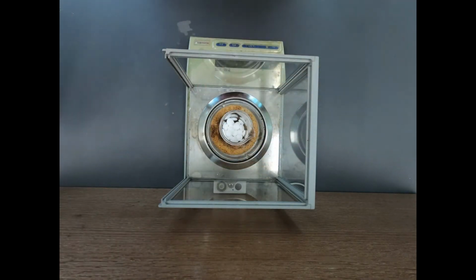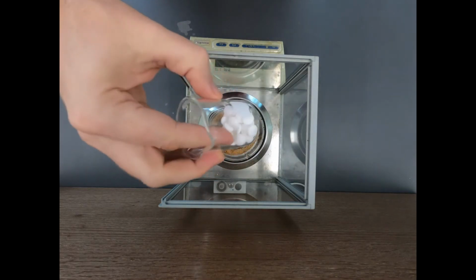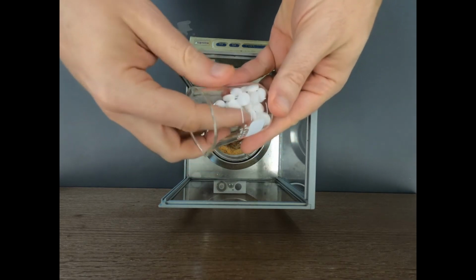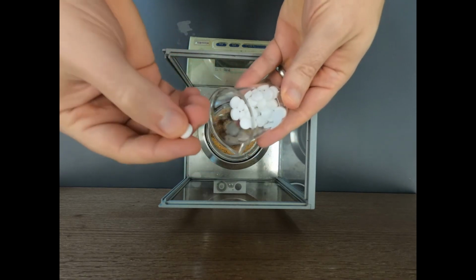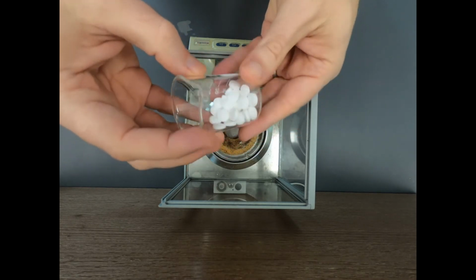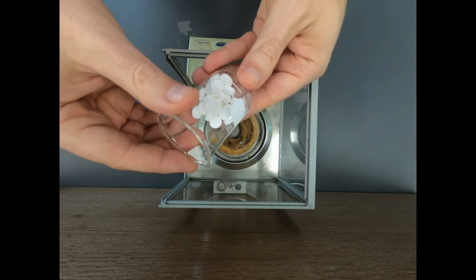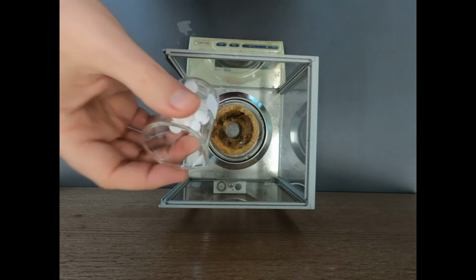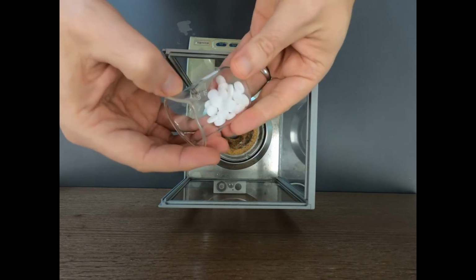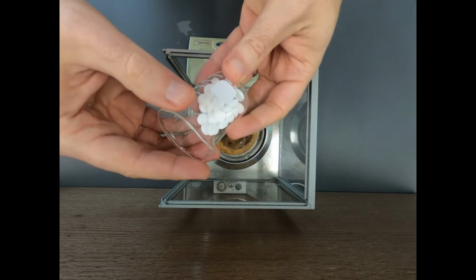So 11.31 grams. If you take 325 milligrams and multiply it by 30, you get just under 10 grams. So I'm weighing just over 11 grams. So there's maybe 1.5 grams of extra material in these tablets, which is not aspirin. So our goal for the experiment is to separate the non-aspirin stuff from the aspirin itself. So we're going to have to grind these up and do a solid-liquid extraction. So we have our material, we have the mass of the material, and now we will go to the hood and commence this extraction process.